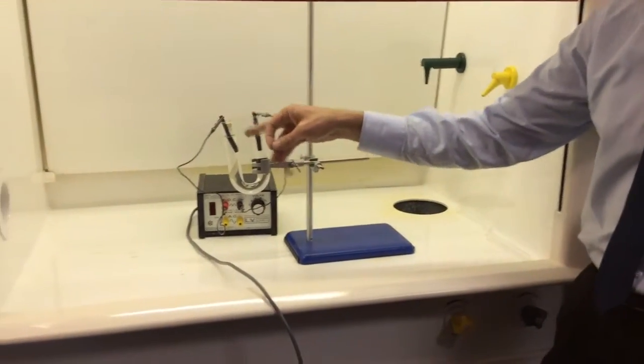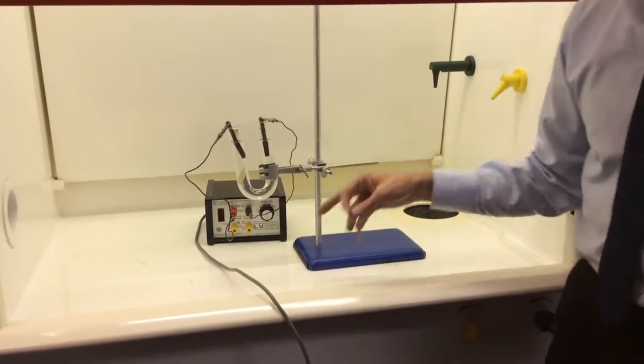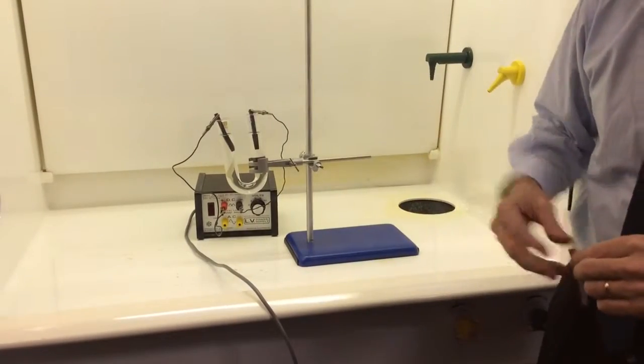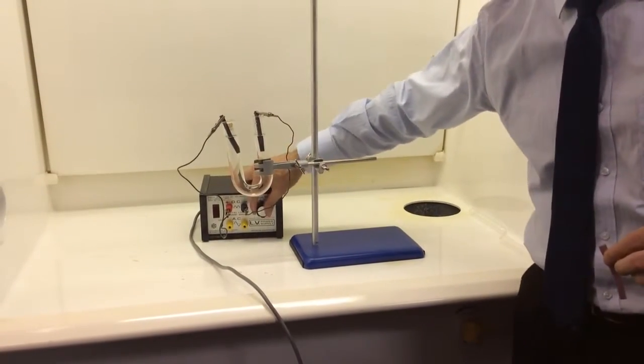Sodium chloride solution, we've got two inert carbon electrodes in it. We're just going to electrolyze it, so I'm just going to pass an electric current through it.